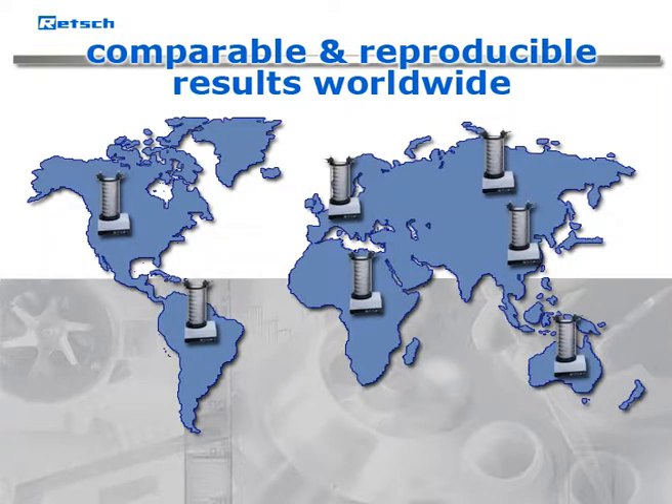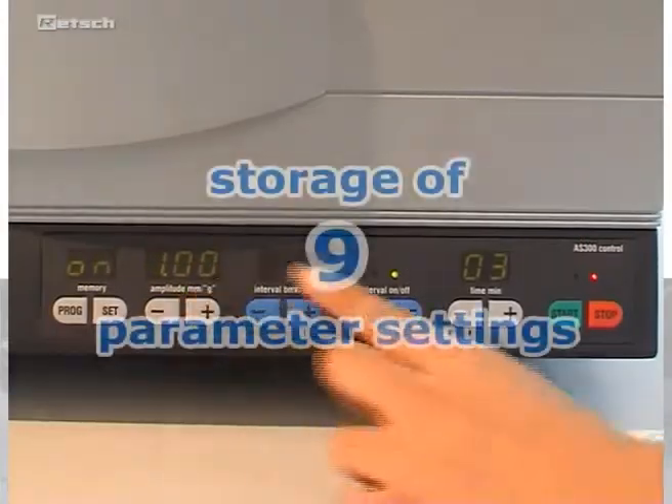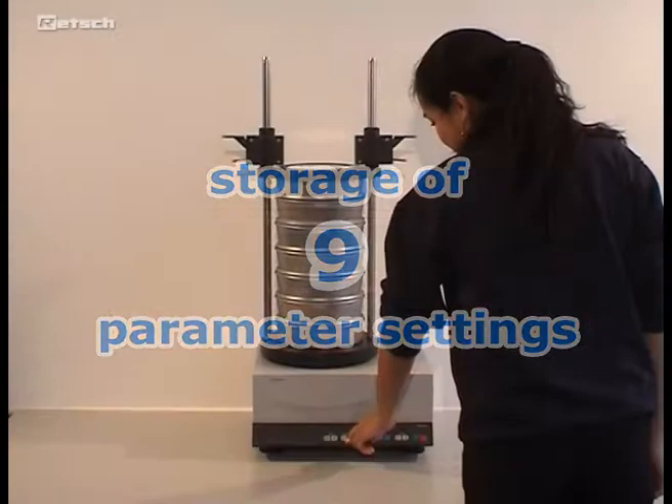Results are independent of operational parameters such as loading, age, or condition of the unit — an advantage that only REC sieve shakers offer. Additionally, nine parameter settings can be stored for routine sieving processes.